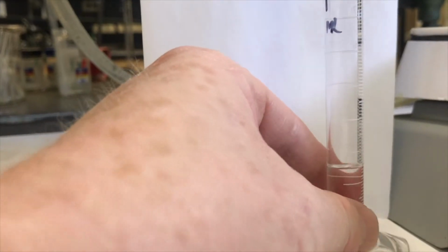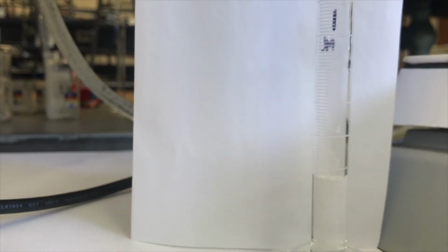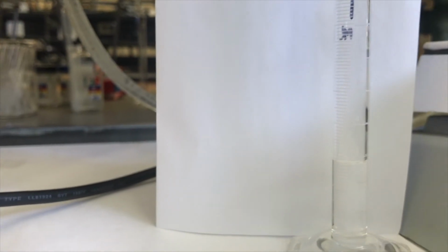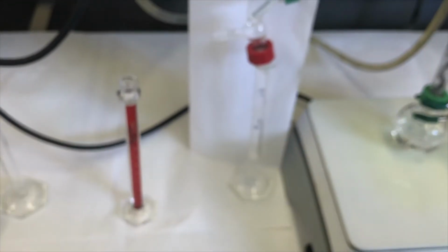Okay, let's call it my second graduated cylinder, and I'm going to get some 3 milliliters in this one. I'll look at the temperature then. I think it's at about 3 milliliters, and the temperature is about 81 degrees Celsius. So my initial one had almost 2, so I'm at about 5 milliliters.